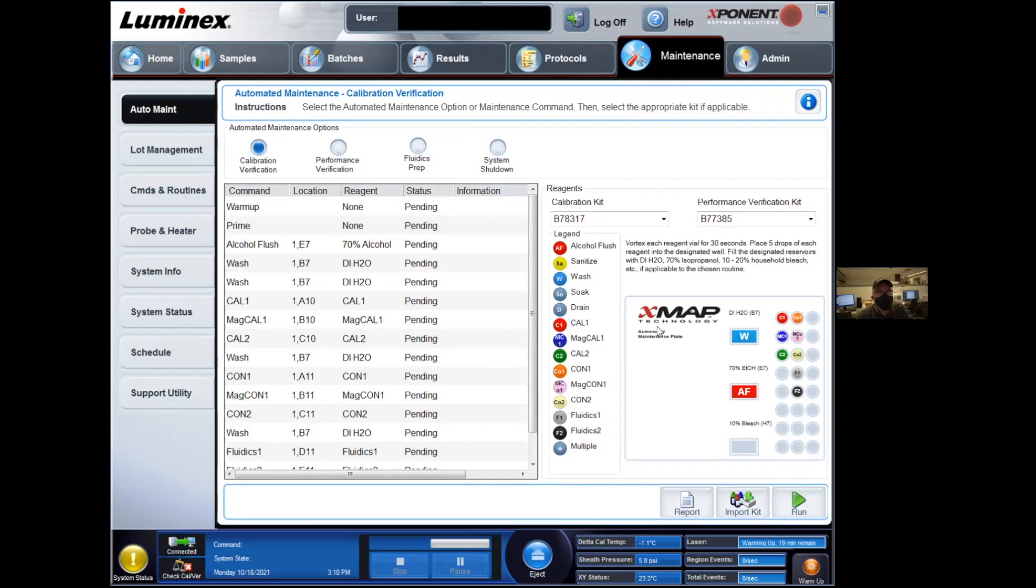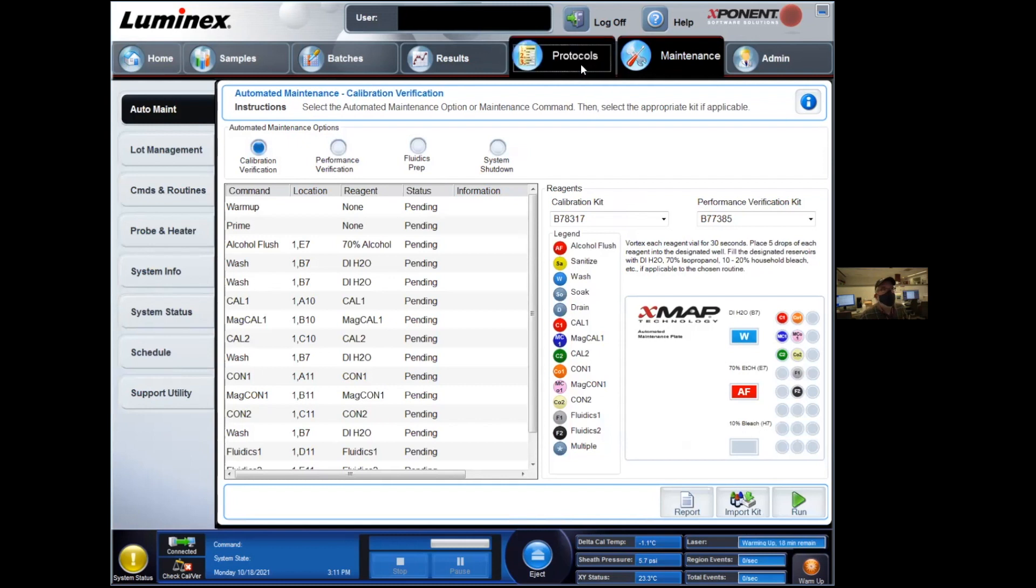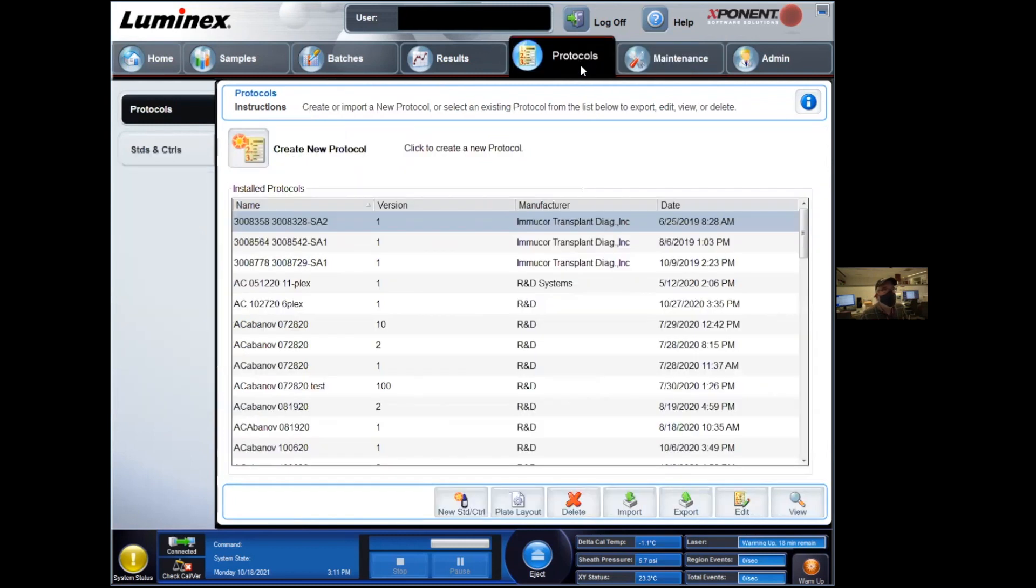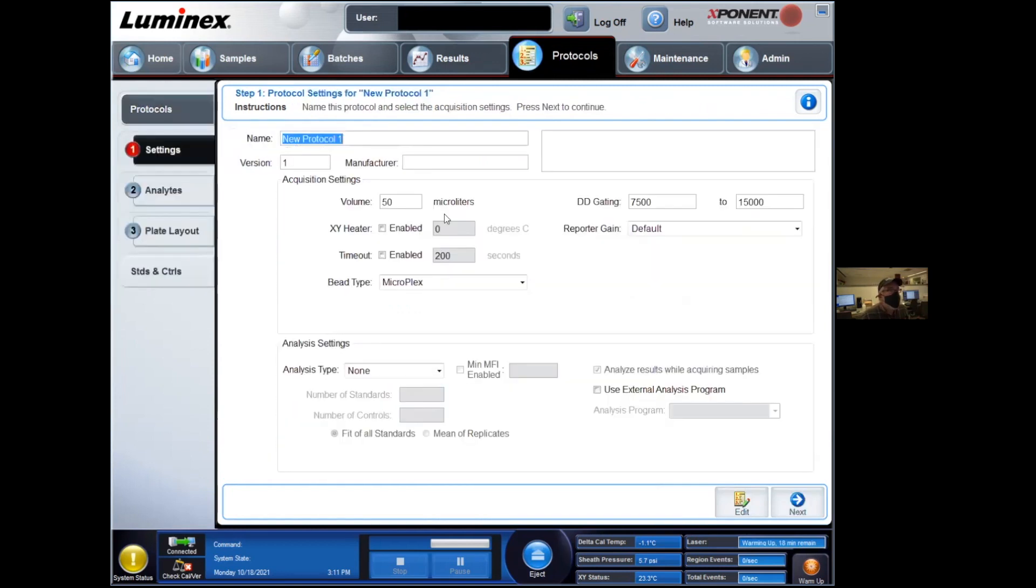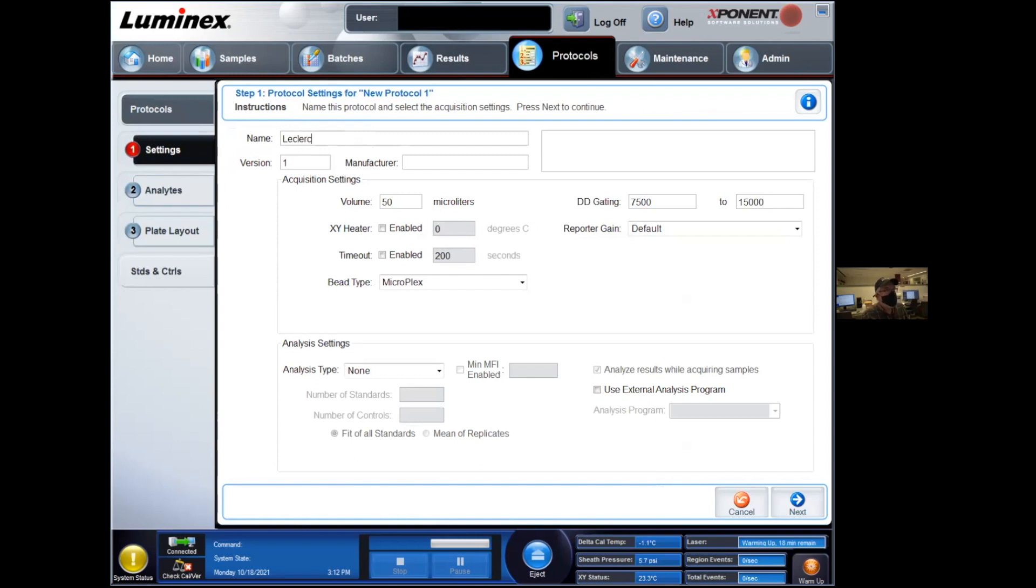For the purpose of this video, we're going to skip ahead to actually setting up an actual experiment. So the first thing we're going to do is go to protocols and create the new protocol. The protocol will contain all the information about the experiment that you're running. You're going to be asked a series of questions, information about what you're actually doing. So the name of the protocol, I recommend something that you'll be able to recognize. Your name and date typically will work just fine.